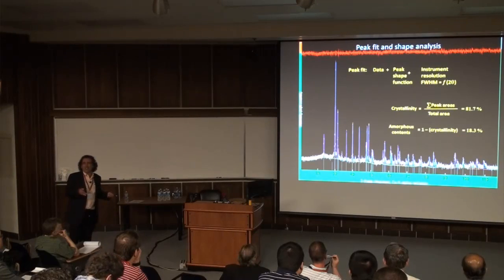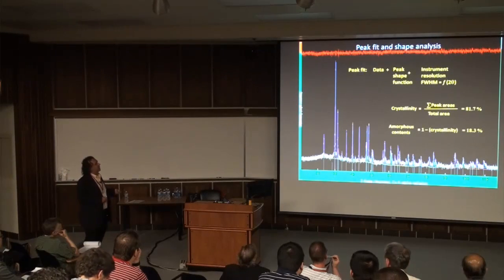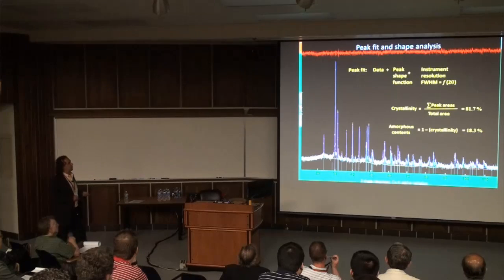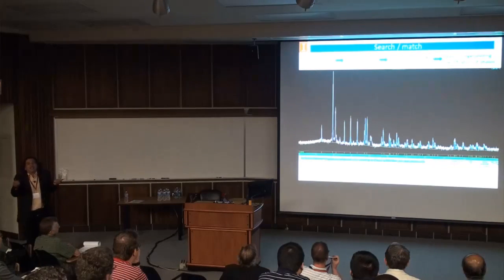That's basically what I put there when I actually prepared the sample. So the background here under the curve will correspond to the amount of amorphous. Of course, we subtract the background from the sample holder. Okay, what the heck is in the sample?